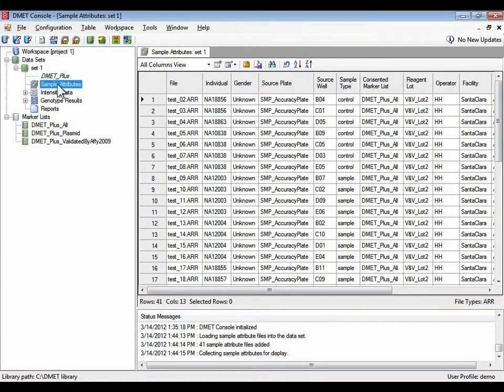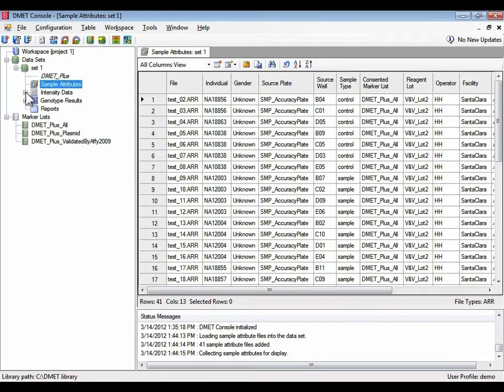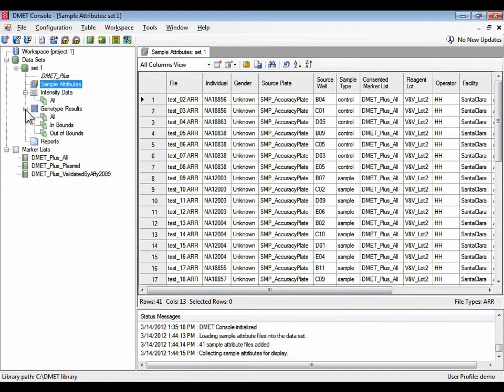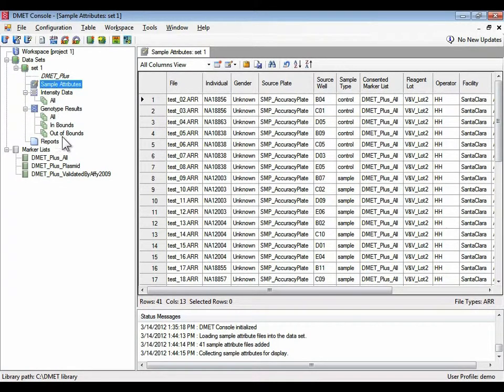Sample attributes, which are the ARR files. Intensity files, that would be the CEL files. Genotype results files. This is what eventually are also known as CHP files.